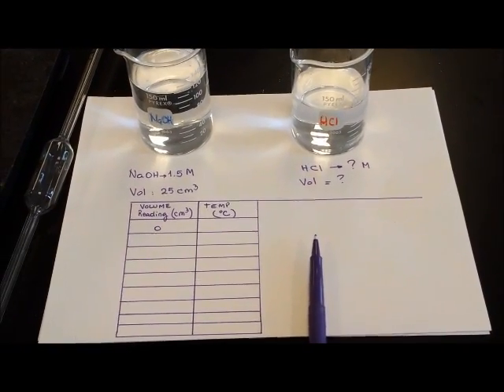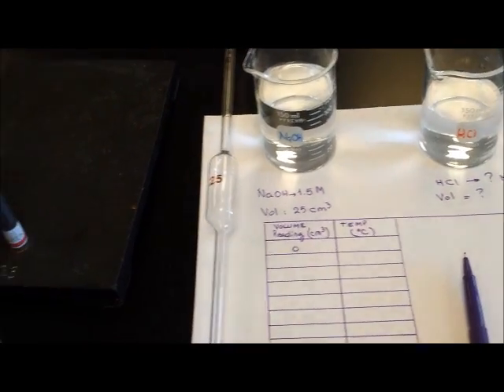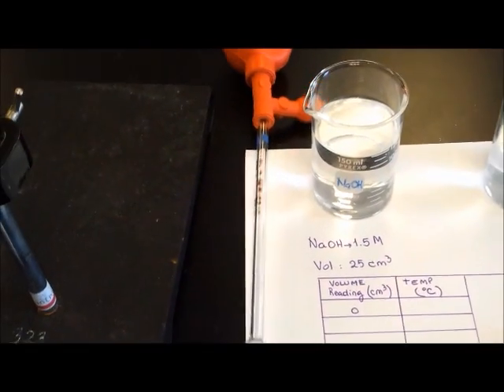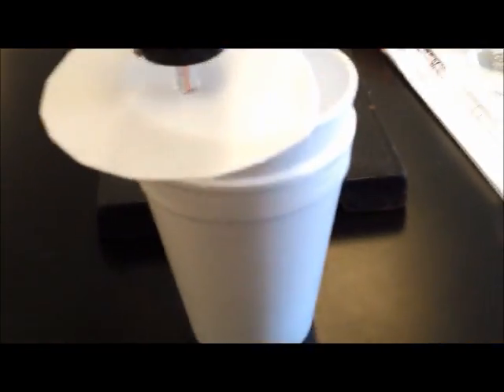In the meantime, while the temperature stabilizes, we will build up a data table with the volume and the temperature. The initial volume will be zero, and the initial temperature will be the one that we read after it is stabilized.